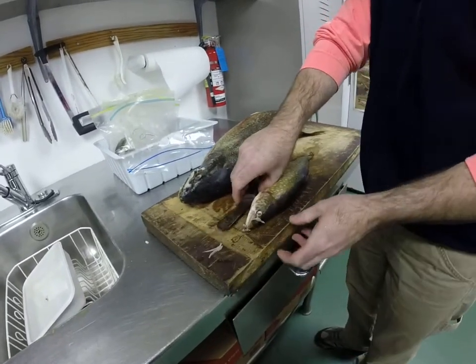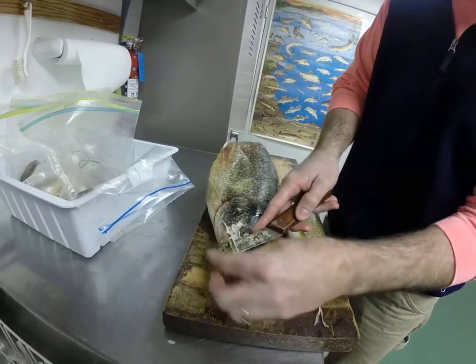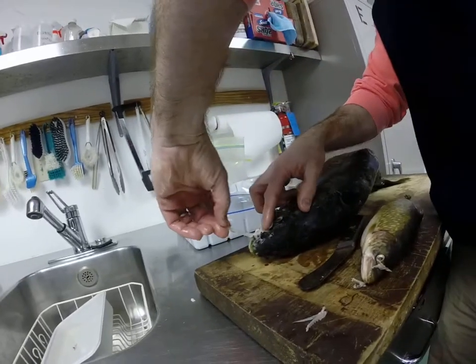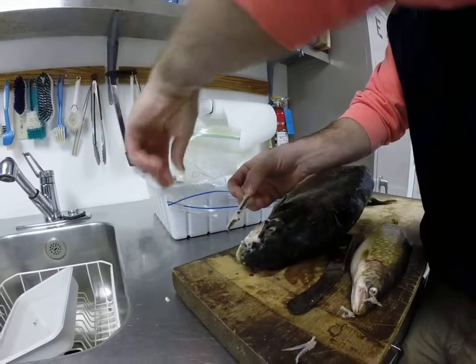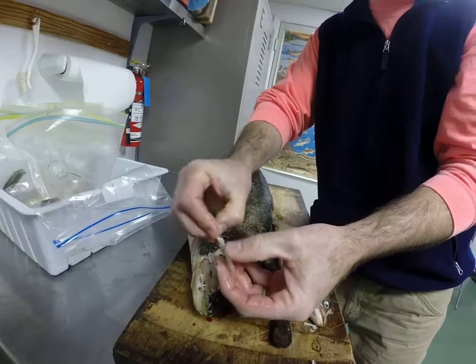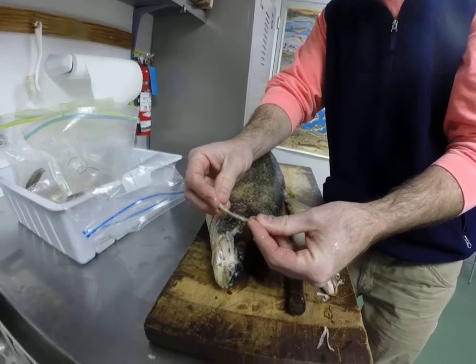We'll do a little bigger one here — this is the right side but nonetheless. Cut back there, fold it over, and you'll see that bone will pop out right there and it pops right off. This fish has been frozen so it came out very quick. May need to trim that up at some point, but fairly clean bone. Dry it out and we're ready for processing.